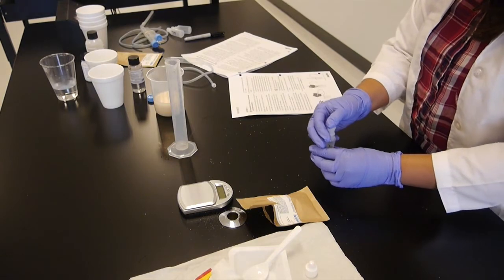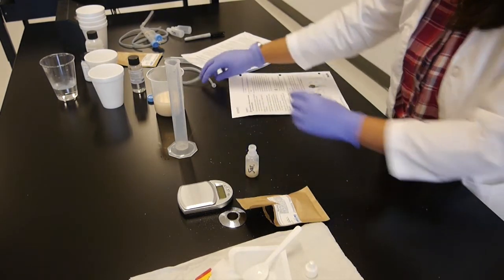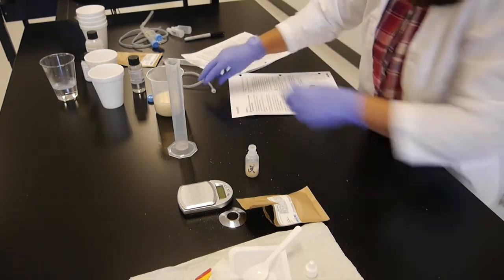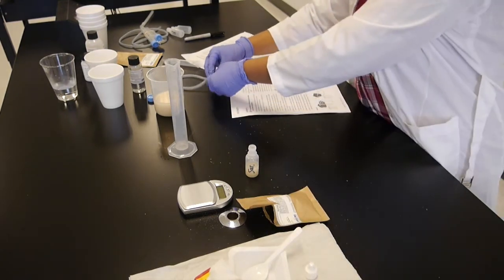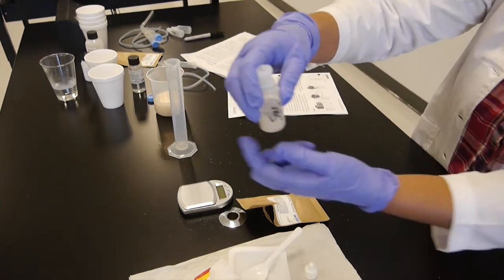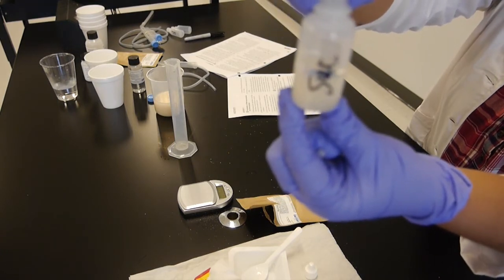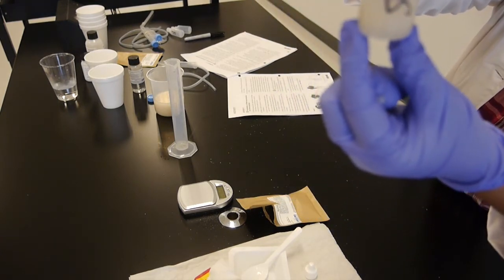So now, let me insert the dropper. So this is how, see the oil layer at the top?